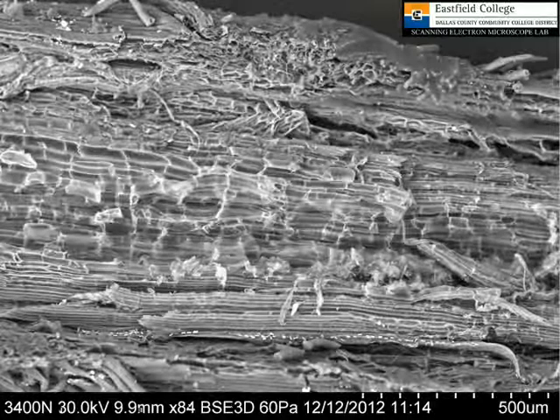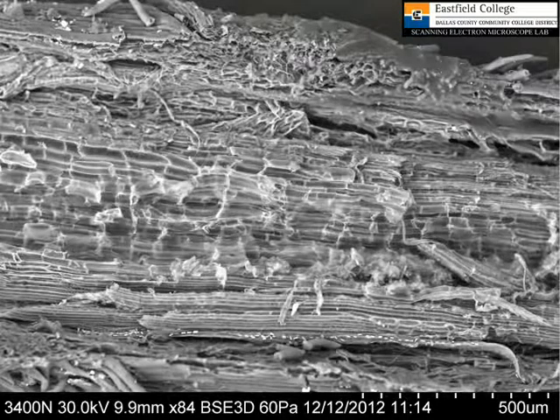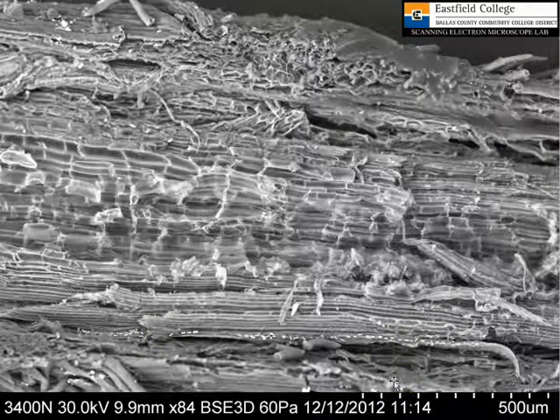So here's a cross section of a stem. What I did is took the stem and I cut it longwise, and you can see the center pith area here, and then you can see more of the conductive tissue down in this area. And something kind of weird, we'll see this again in other pictures. These little blocks of something, and I have no idea what they are, but they keep showing up again and again. They seem to be solid. We'll show you a picture in a second.